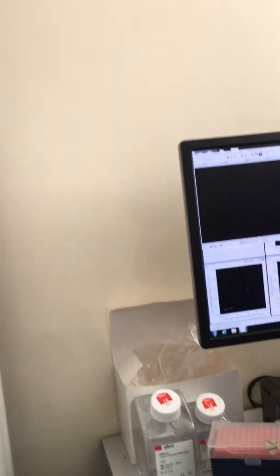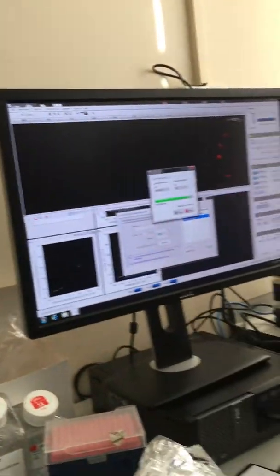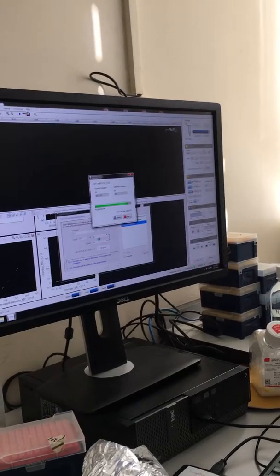It seems the sample here is more diluted. Yes, it looks like it, because remember the cyan, you had your negative beads as well. So you've got positive and negative, so you have double the amount of beads, whereas with this it's just the one type of bead, isn't it?